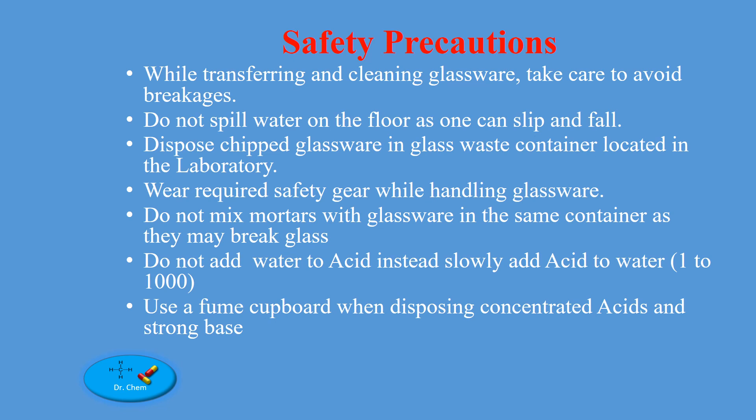Safety precautions: while transferring and cleaning glassware, take care to avoid breakages. Do not spill water on the floor as one can slip and fall. Dispose of chipped glassware in the glass waste container located in the laboratory. Wear required safety gear while handling glassware. Do not mix mortars with glassware in the same container as they may break the glass.